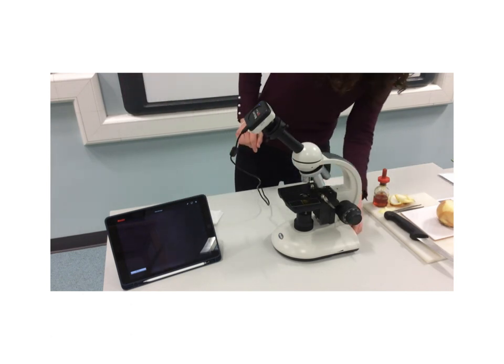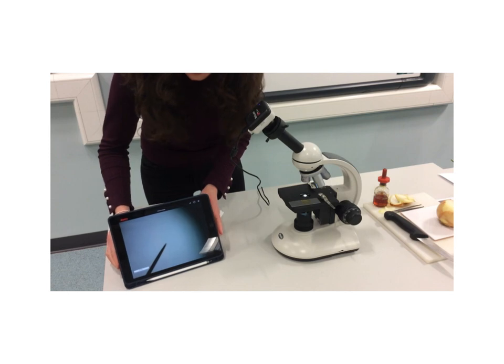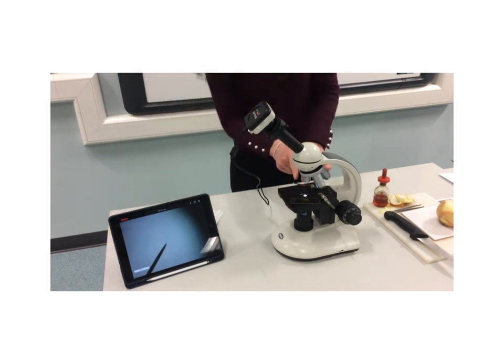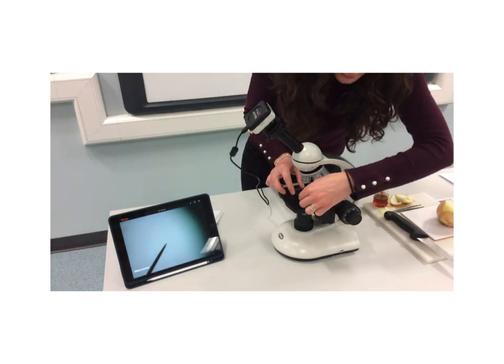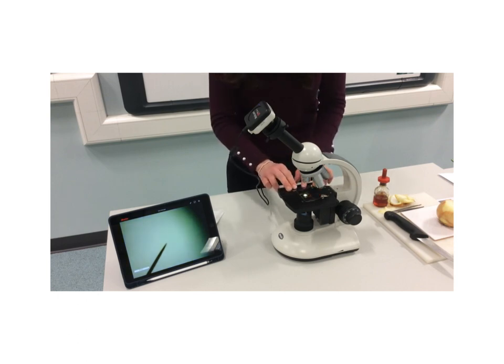So I'm going to turn on my microscope again. I just turned the light off there. Hopefully you can see that it's at a good angle for you to see. And again, I'm starting with my low power lens. So remember, it's really important that when you're viewing an image for the first time, that you view it on the low power lens. So I'm clipping my slide in place using the clips. I'm clipping it on the stage over where the light is coming up.